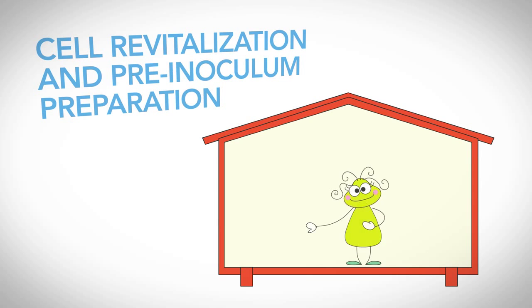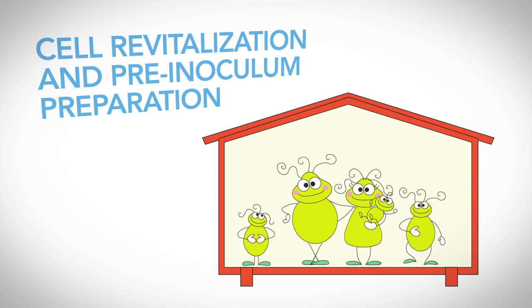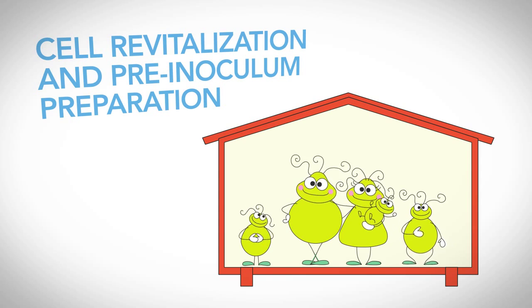Cell revitalization and pre-inoculum preparation. The cells taken from one of these vials are revitalized and then cultured using a rich growth medium to obtain the pre-inoculum.